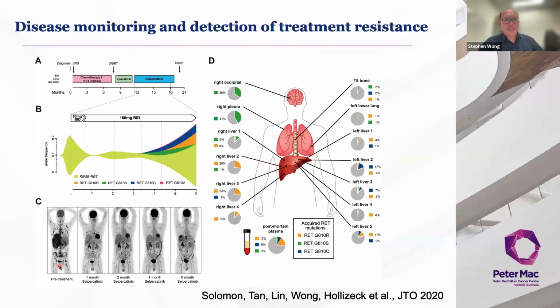Overall, these kinds of studies highlight the utility of using genomic analysis via ctDNA to understand not only molecular stratification of particular important targets, but also resistance mechanisms and clonal evolution of cancer patients, which was not fully achievable through just simple tumor sequencing alone.